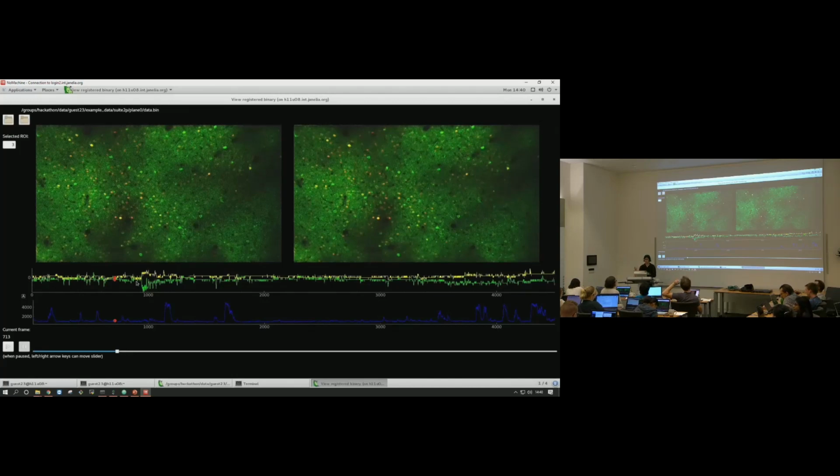If you're getting a lot of movement, if your field of view is moving more now that you've registered it, you probably want to decrease that. But if you haven't been able to correct enough, you might want to increase the amount you allow it to move. Because I can again see from the metrics, right? So that's something you might be able to see from the metrics and also when you watch the movie too. It should never move more after you register it.